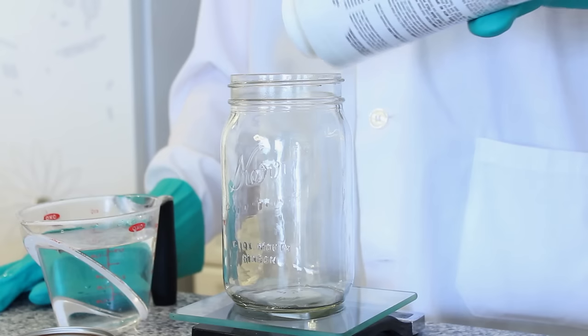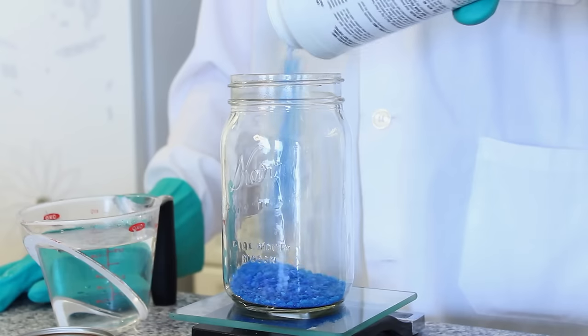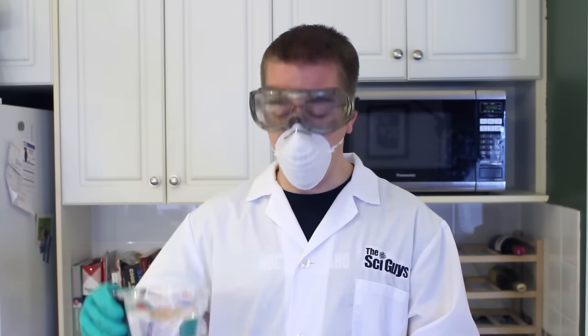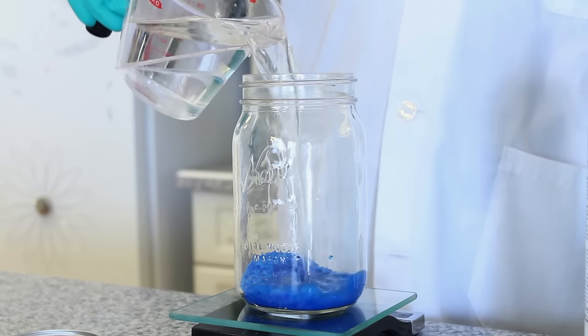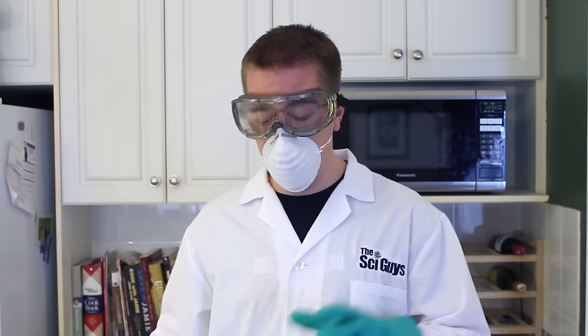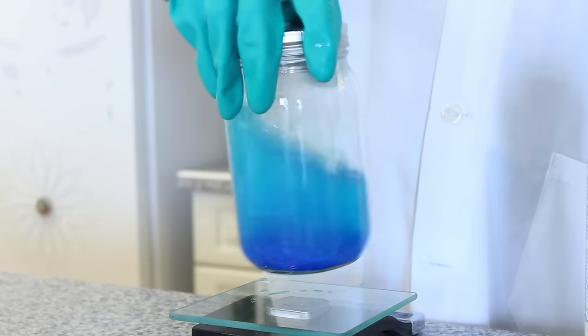The first step in our experiment is to make our copper sulfate solution. Add 100 grams of root killer to your mason jar. Then pour in 2 cups of hot water. Put the lid on the mason jar and give it a gentle swirl until all the crystals are dissolved.